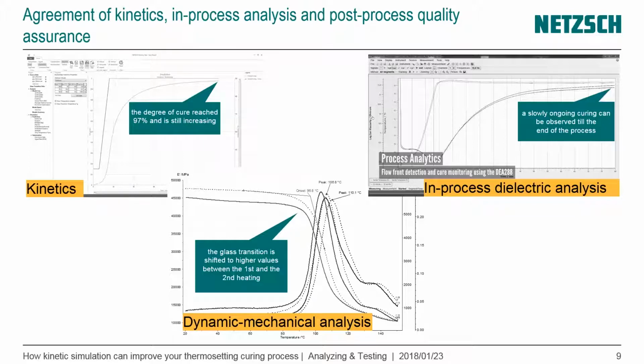So we could see that all of the measurements we did resulted in the same results.